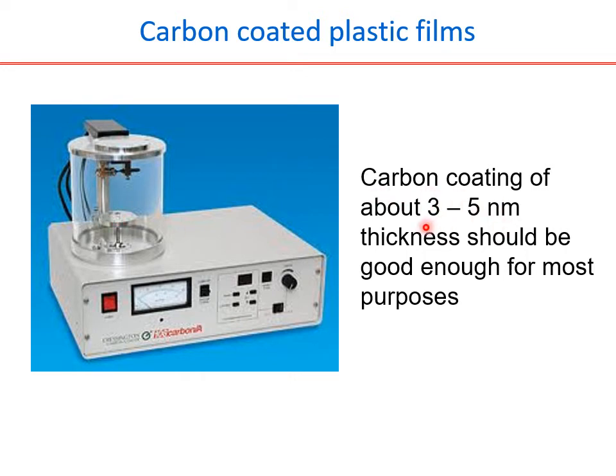Then here I said a carbon coating of 3 to 5 nanometer thickness should be good enough for most purposes. So remember this 3 to 5 nanometers is in addition to the thickness that the plastic films provide. So that's the reason I said it is an individual choice whether to include the plastic films or the carbon coating.